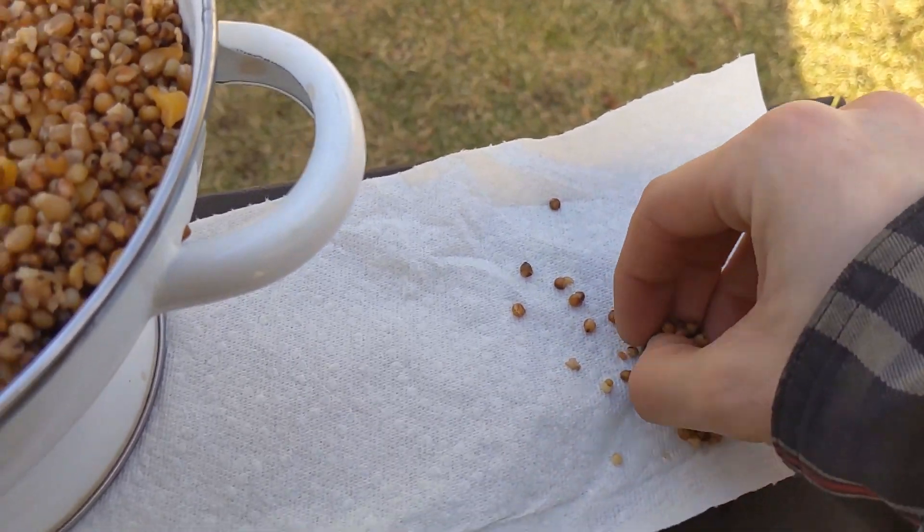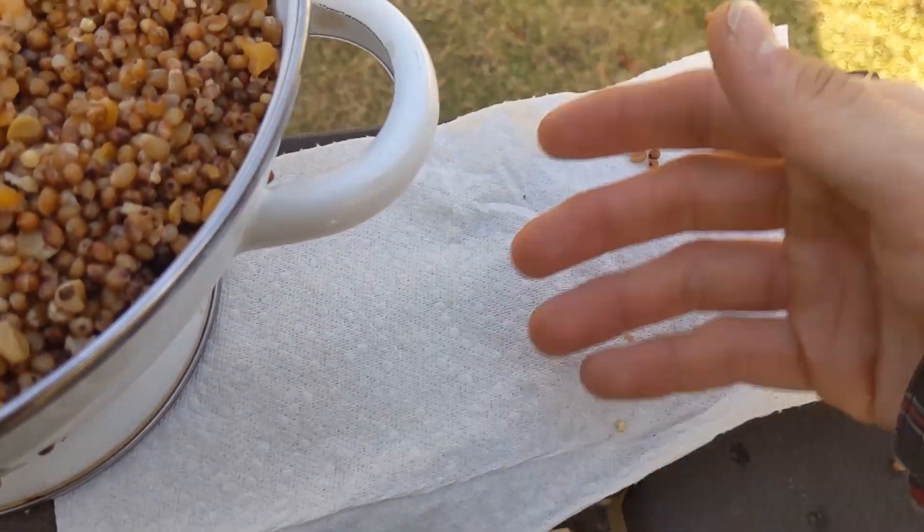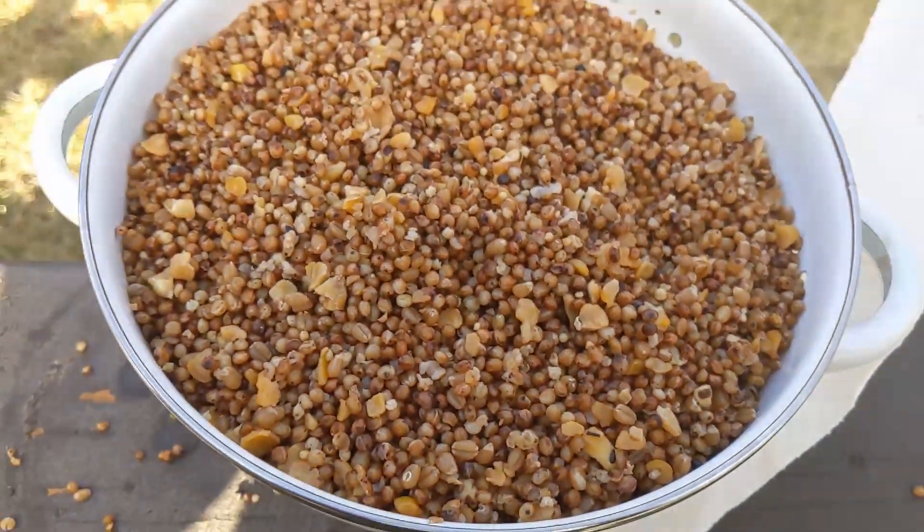It's been 15 seconds, so I'm just going to remove them. As you can tell, it's good — it's not wet at all. So we're going to go ahead and jar these.